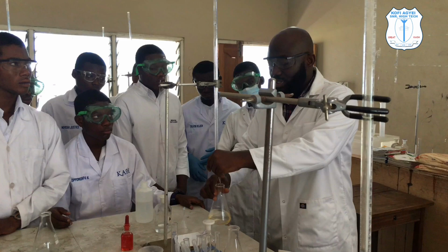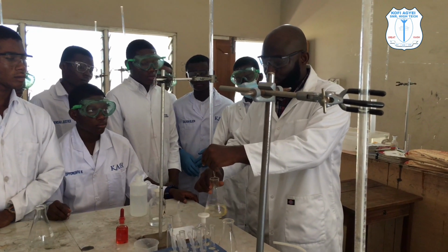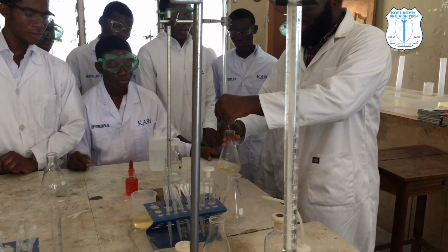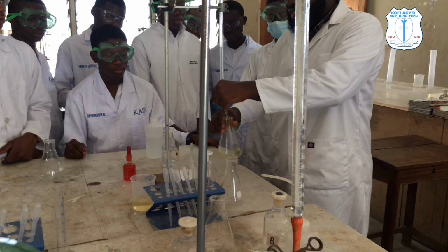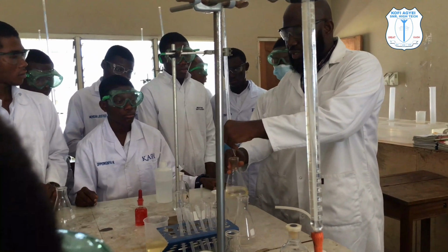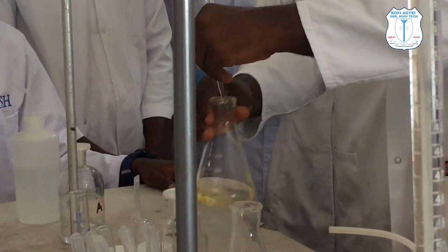So what you're going to do is continue until the color changes. Now when you add the methyl orange to the base, what color are you going to get? Yellow. Understood? So we're going to get a yellow color. Then you do the titration nicely until the yellow color changes. Do you get it? So in theory, you are going to get from yellow to what? Orange. Do you get it? Sometimes you can also get from yellow to what? Pink.